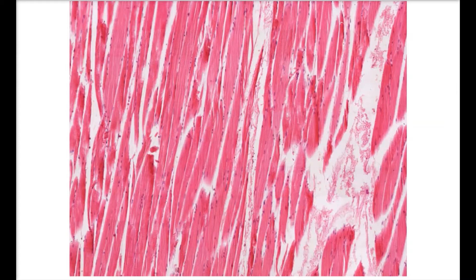The slide we're currently looking at is a longitudinal section of skeletal muscle. In lecture, we learned that skeletal muscle is considered voluntary because it usually doesn't contract unless it receives a signal from a somatic motor neuron. Skeletal muscle attaches to the bones of the skeleton and lets you produce voluntary movements.